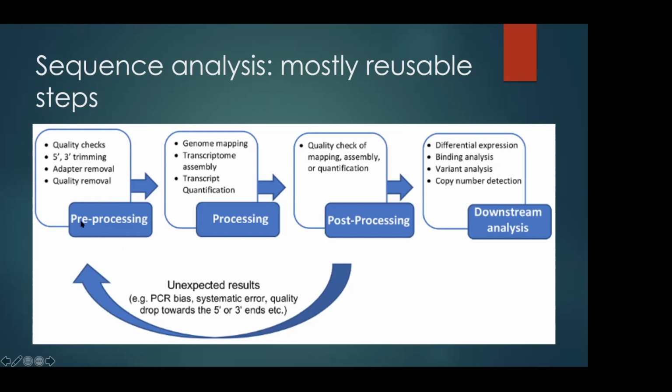And after you prepare all these reads, you are ready to align them to the transcriptome if it is RNA-seq, for example, or you can align them to the genome if it is DNA or ChIP. Sometimes I get a question like, okay, which one is better? Should I map them to the transcriptome or genome? Because you're teaching both. So there is something here that you have to understand. There is no better or worse here.